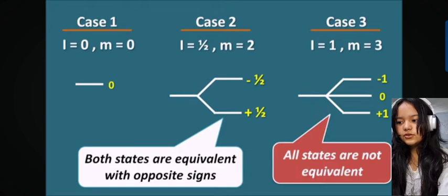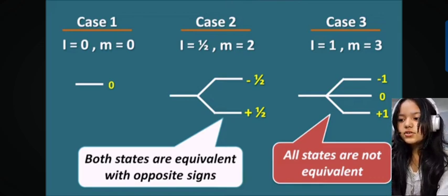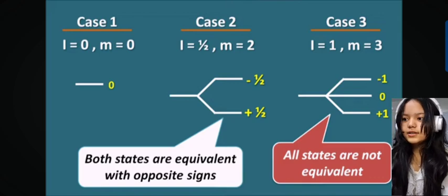So now the nuclei under case 1 where the I value is equal to 0 cannot give the NMR signal. Similarly, the nuclei coming under case 3 again cannot give the NMR signal. So nuclei which have I equal to half can only give the signals.